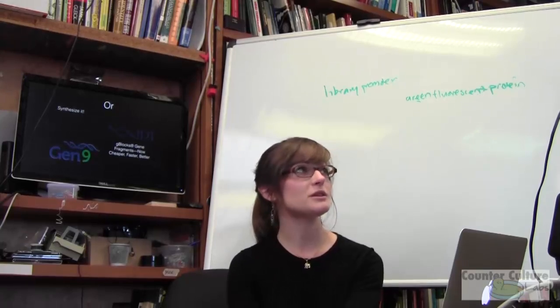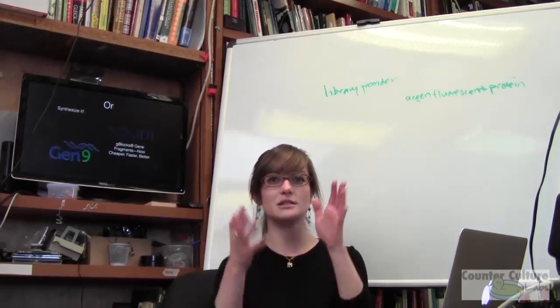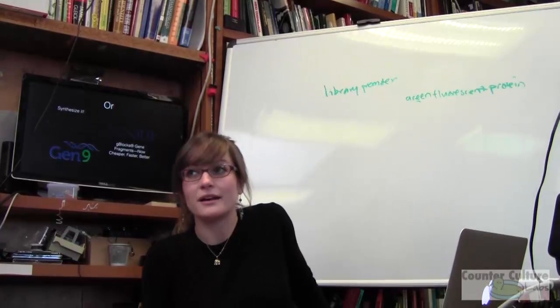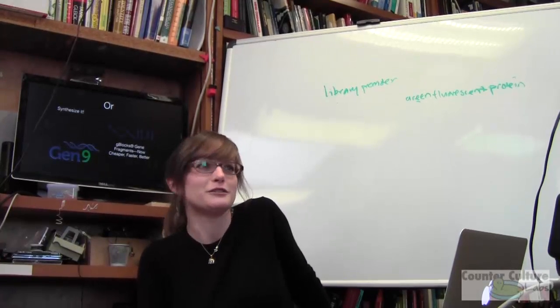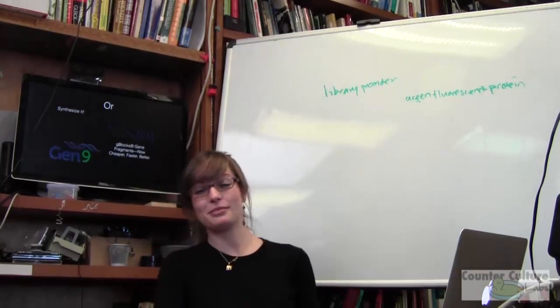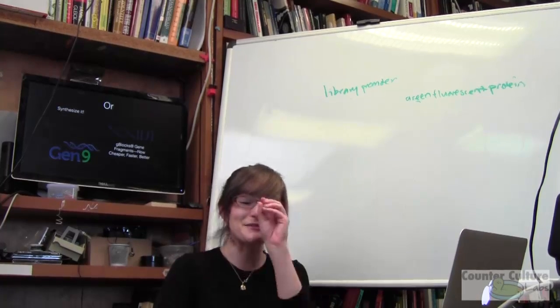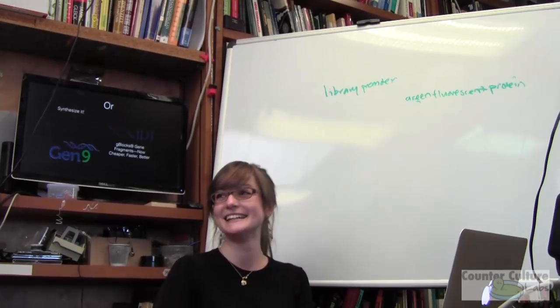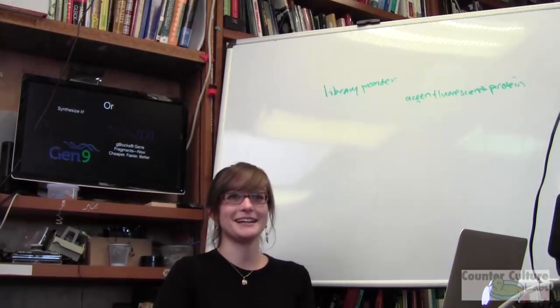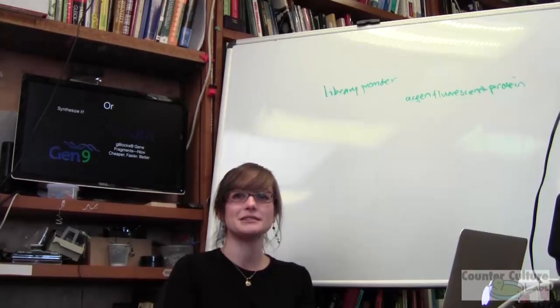So what do you think are some considerations? Okay, so we know all this information. You have the RNA sequence. You can get the DNA sequence from that. You can get your gene synthesized. Then when you get your gene synthesized, it comes back to you as powdered, double-stranded DNA, but now what? Not to mention it's pretty much invisible. Expensive, invisible material. I have this tube of DNA and it's expensive and I don't know what to do with it now.